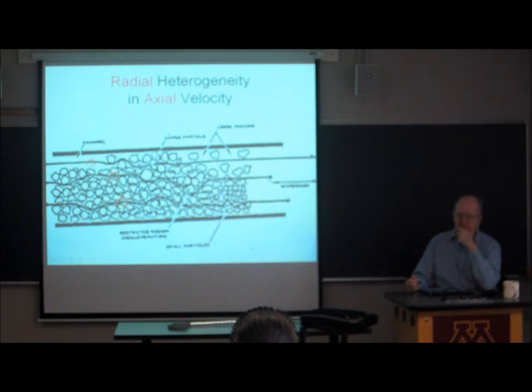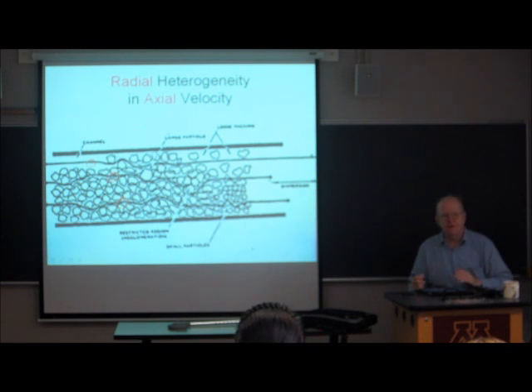Okay, now imagine that you're a molecule and you're in this flow stream, or this one, or this one, but the velocities are not all the same. The molecules are not going to come out the end of the column at the same time.